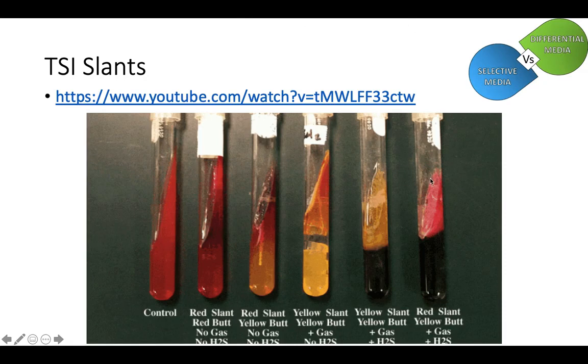So that's all I got for you guys on this PowerPoint, for our media, very commonly used media in microbiology labs and how they work.